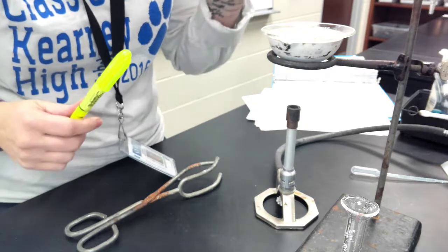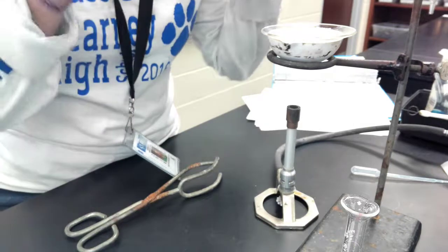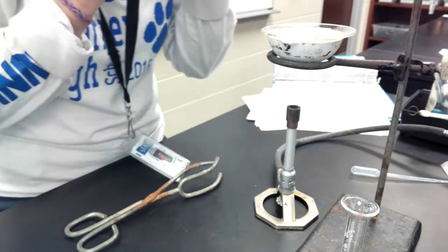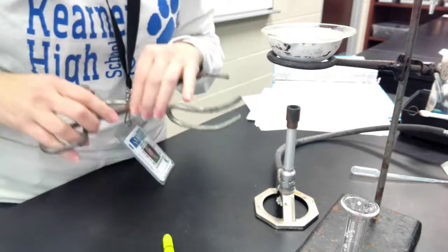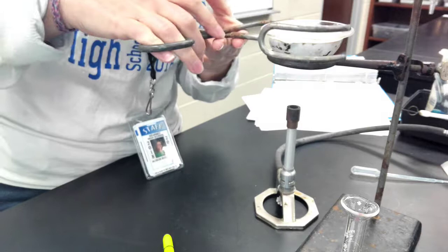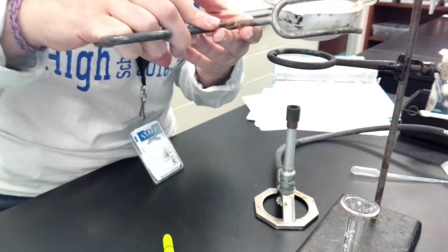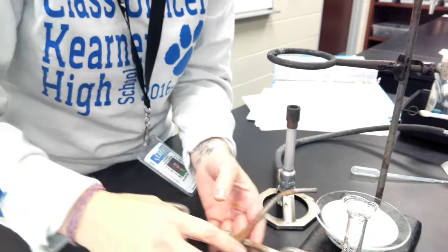Once we have evaporated all of the salt water out of the salt solution and it's completely dry, so that means there's no water on the bottom of my evaporating dish, there's no steam still coming out, I want to remove the evaporating dish from the Bunsen burner. So I have my crucible tongs. I'm going to pick it up. I'm going to remember hot things look like cold things. Gently place it onto my ring stand so that it cools.